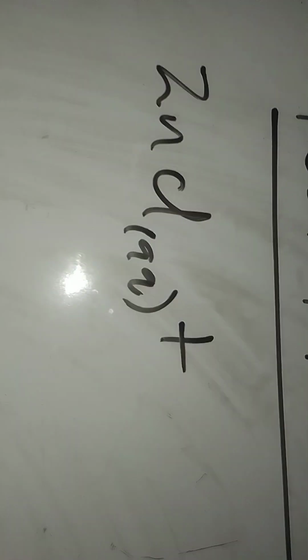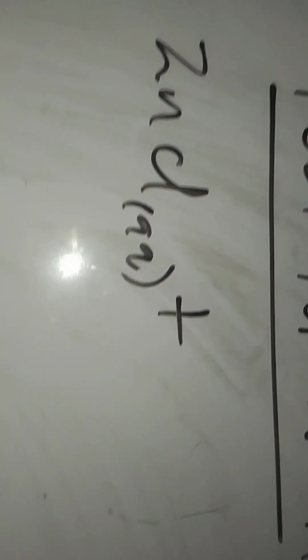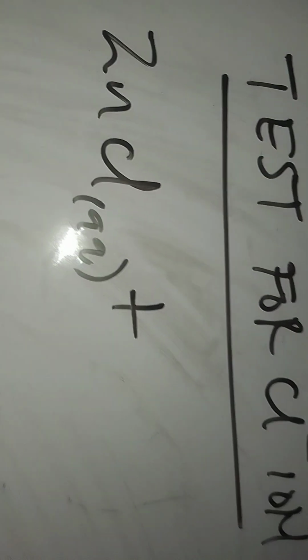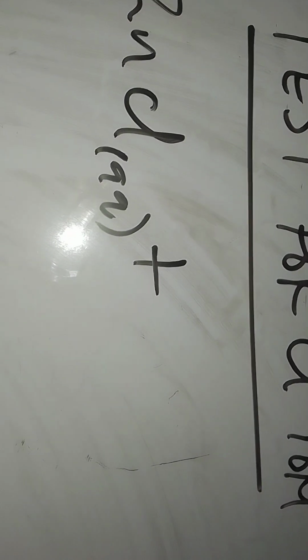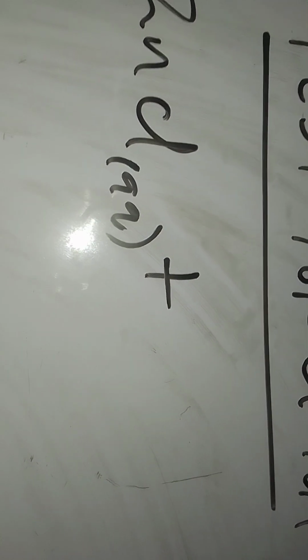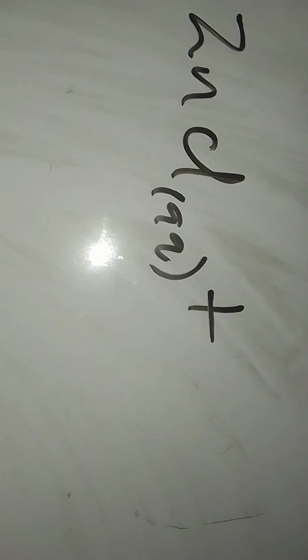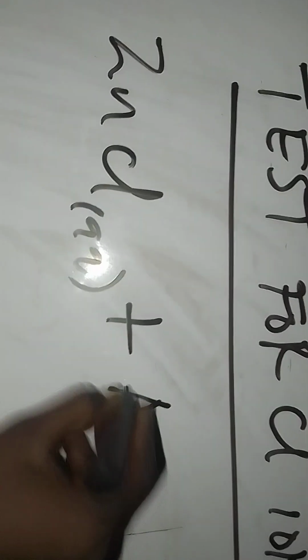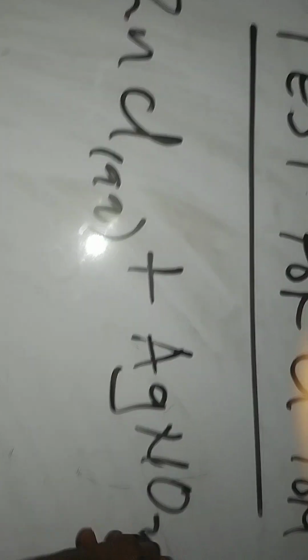They will ask us to add HNO3 followed by AgNO3. When you add HNO3, you are not going to see anything, no visible reaction. But the essence of adding HNO3 is to prevent the precipitation of foreign ions. So the active agent here is AgNO3 solution.